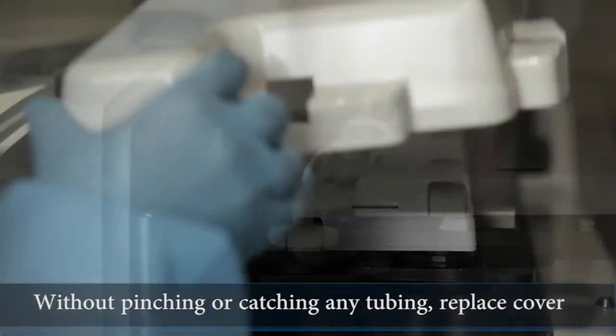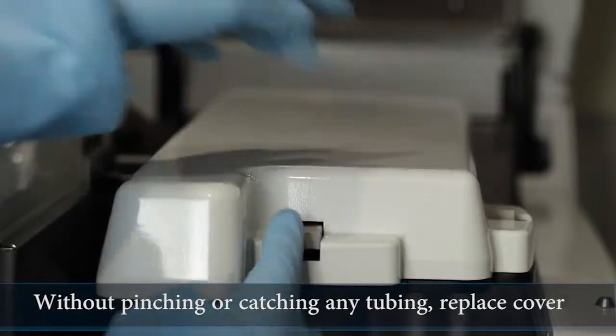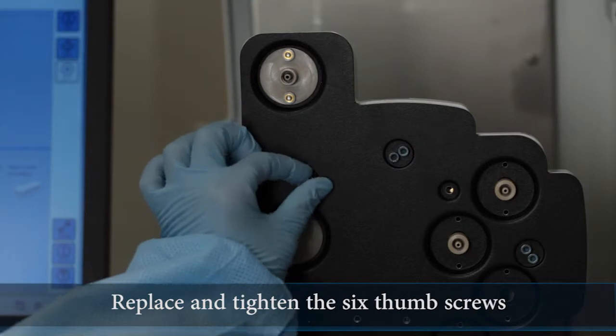Being careful not to pinch or catch any tubing, place the manifold cover back in position, lift the manifold while holding the cover in that position, and replace and tighten the six thumb screws.